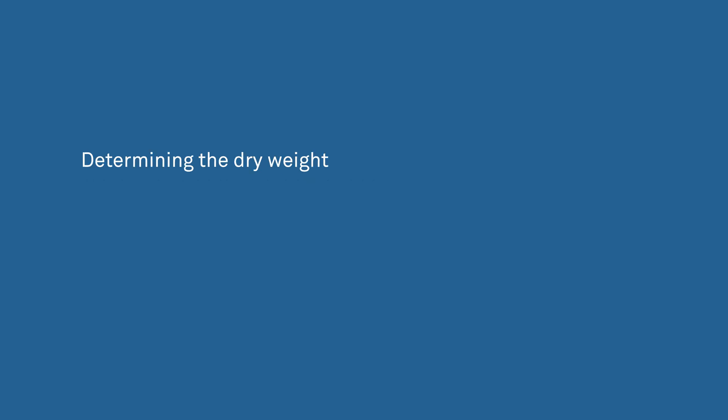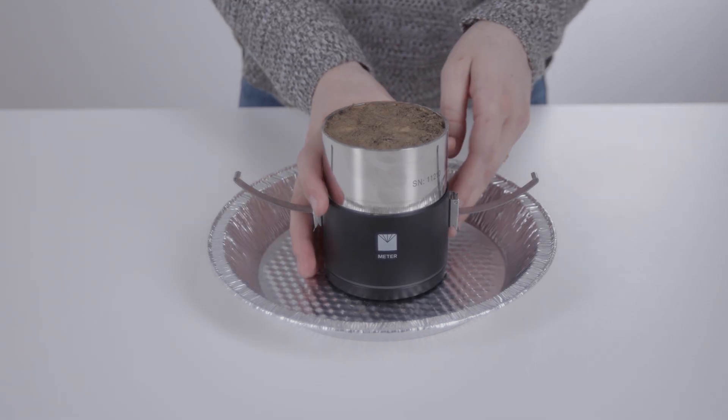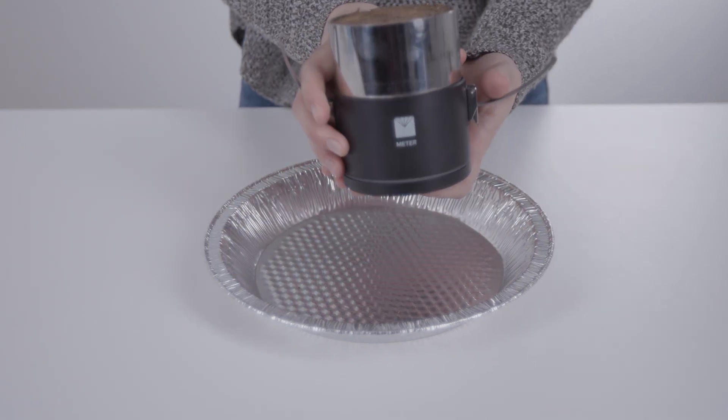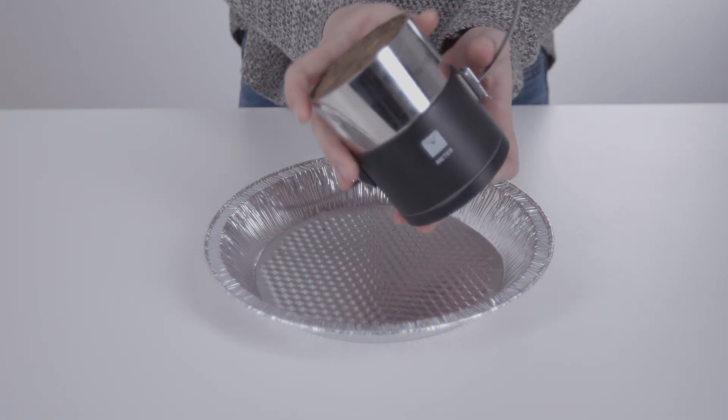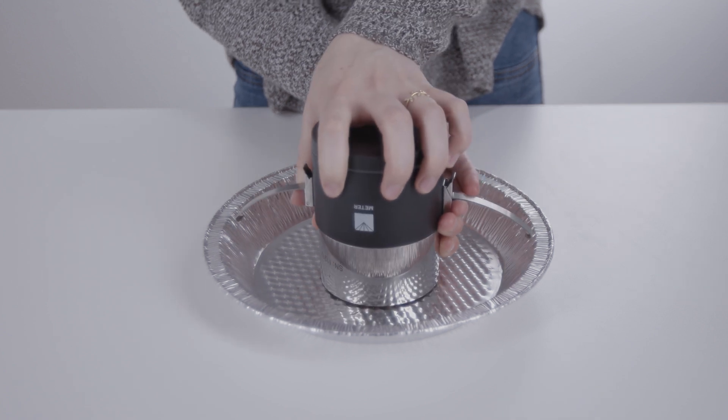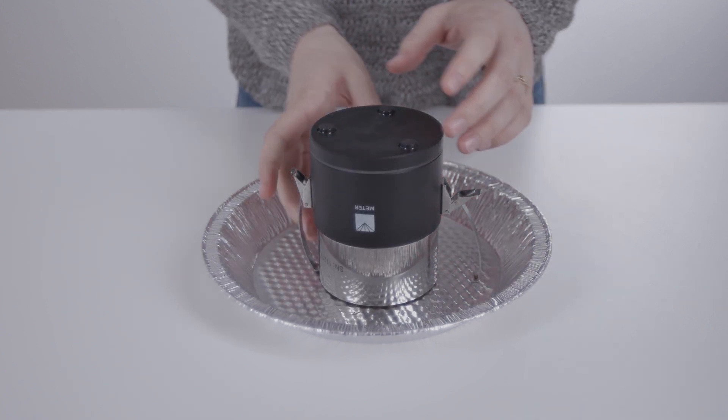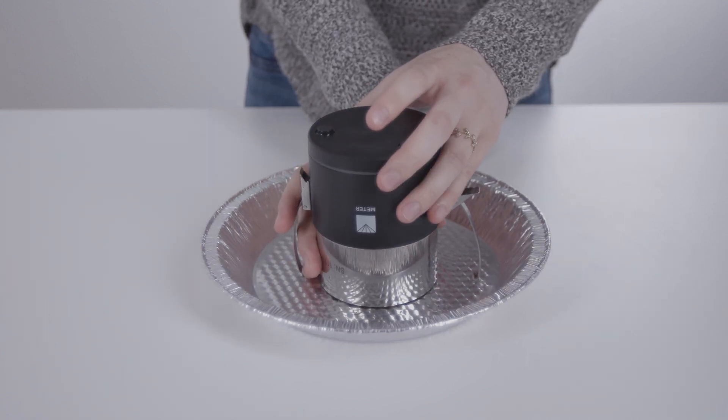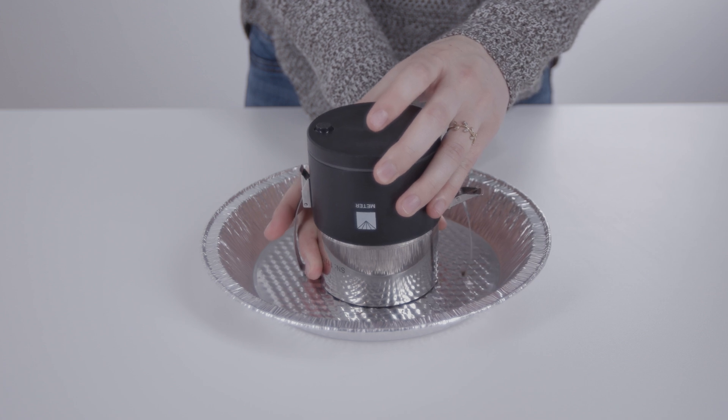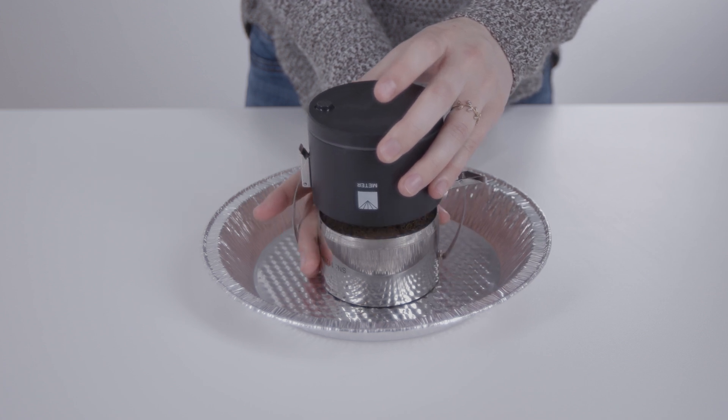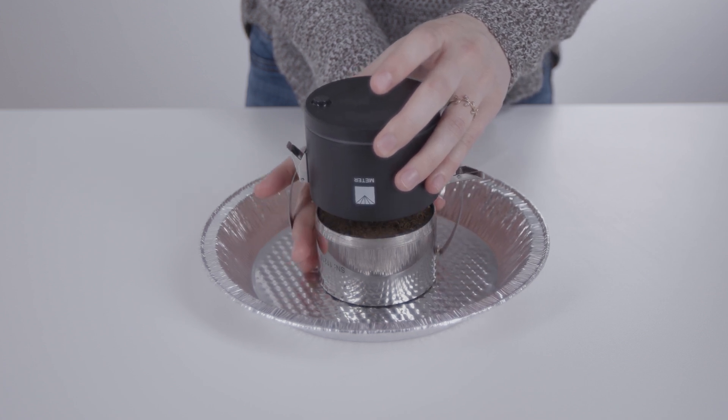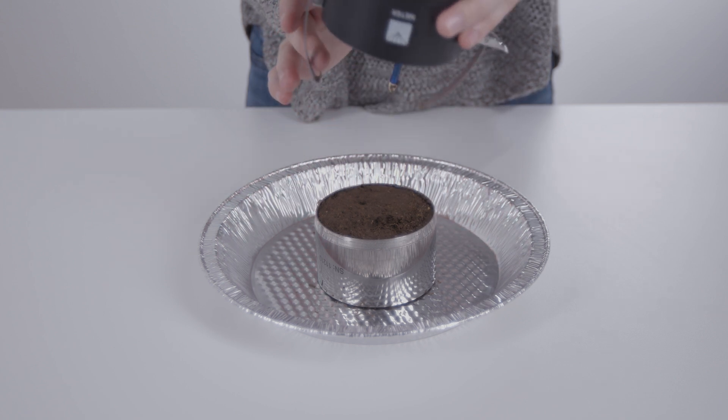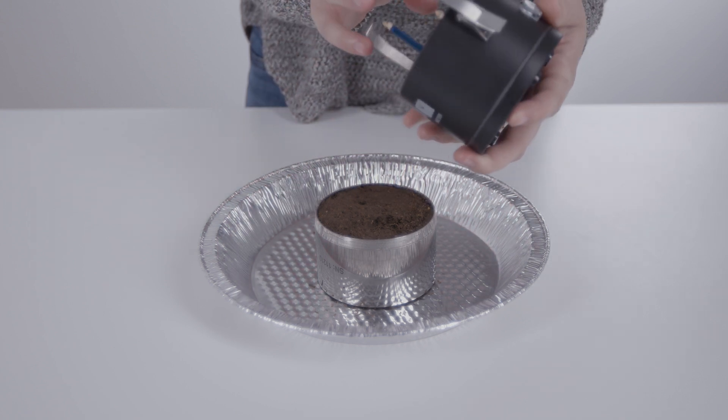After the measurement, the HYPROP needs the dry weight of the soil sample to calculate the volumetric water content based on the weight reduction. Put the soil sample in a drying pan. Open the clips of the sensor unit.